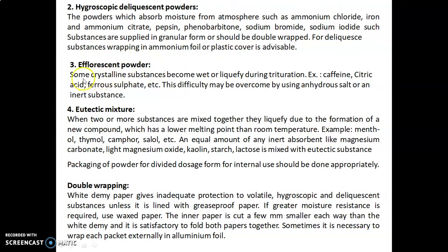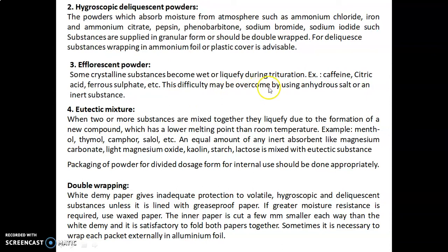Third, efflorescent powders. Some crystalline substances become wet or liquefy during trituration, for example caffeine, citric acid, ferrous sulfate, etc. This difficulty may be overcome by using the anhydrous salt or an inert substance.